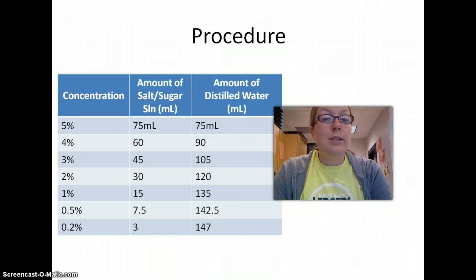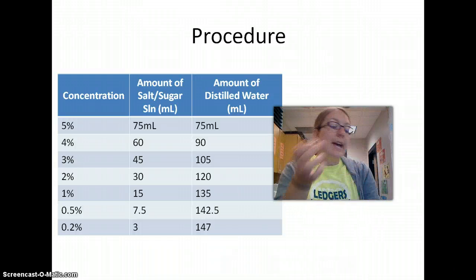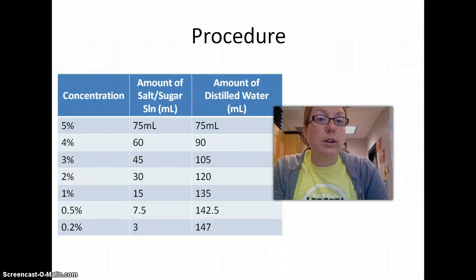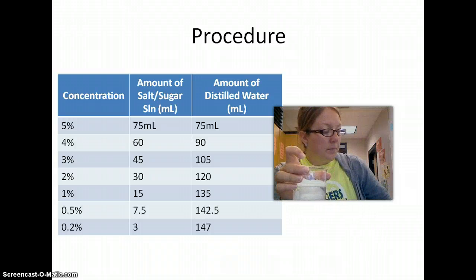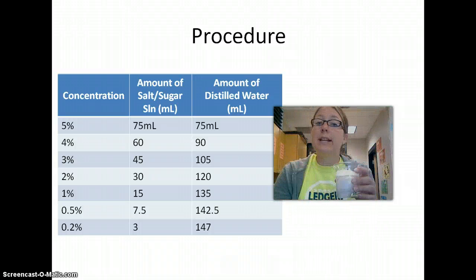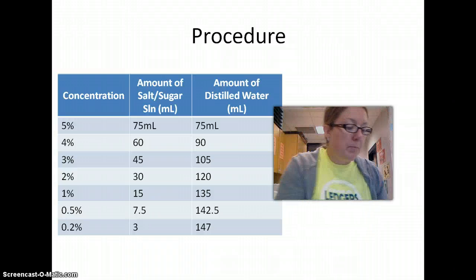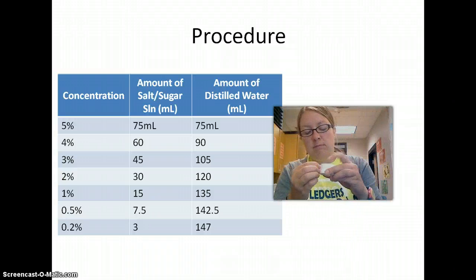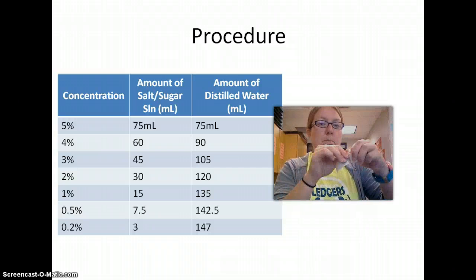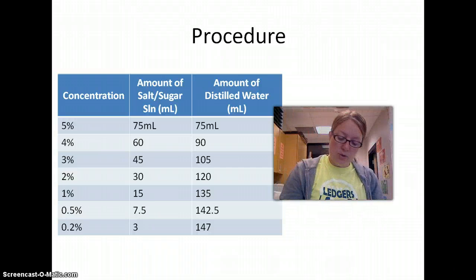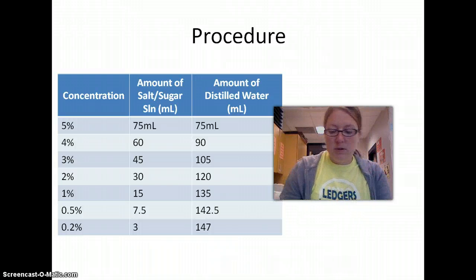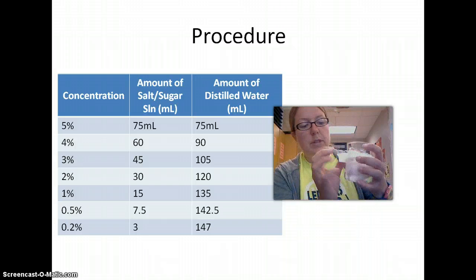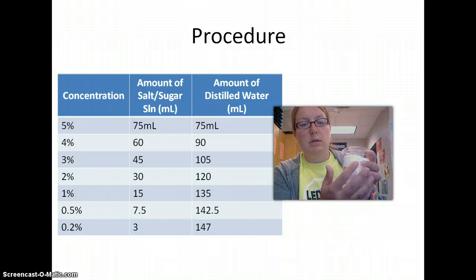Take the egg over to the balance and put the weigh boat on the balance. Make sure you push zero so that the scale says zero. Then you'll put your egg — just your dry egg — into the weigh boat and take your initial measurement. You can then go ahead and put your egg back in the beaker and now you're ready to make your solution. For the control, I'm simply going to take some tape, write 'control' on it, and put that right on the beaker.